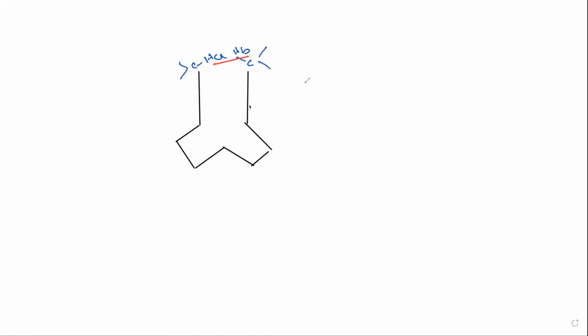When we irradiate a nucleus, the excited nucleus undergoes spin relaxation, that is, transfer of its spin energy to the adjacent nucleus. For example, if we irradiate the HB proton, the stimulation is transferred through space to the relaxation mechanism of HA.